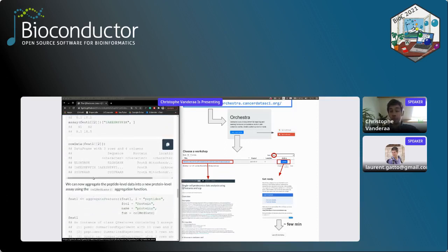When aggregating, it will also transfer the raw data to the aggregate feature. It will only do that if the variable is common to the peptide. So for instance, sequence belongs to the peptide, so it was common for all the different PSMs belonging to the same peptide. Protein as well, and location as well. However, remember there was this p-value that we showed, and the mock variable. Well, those were specific to PSM, so those are lost. They are not transferred to the peptide data.